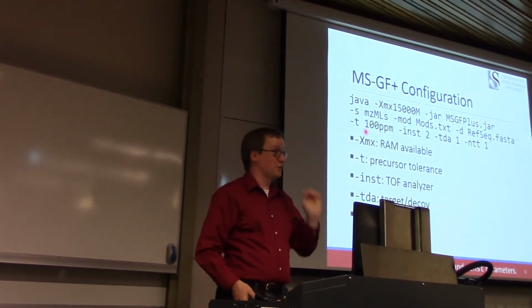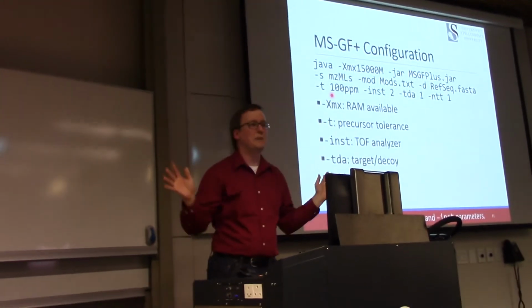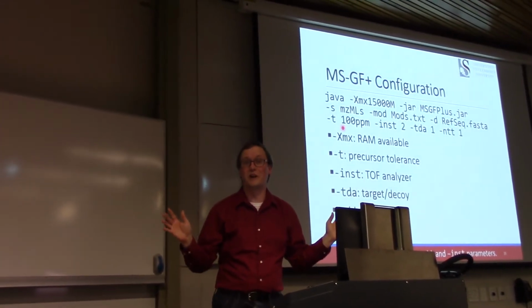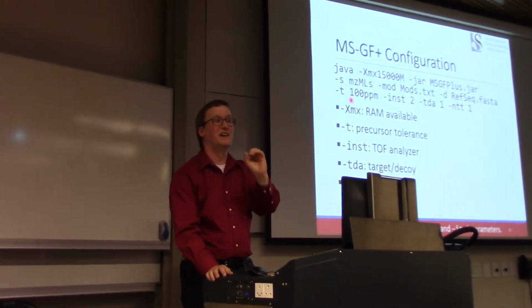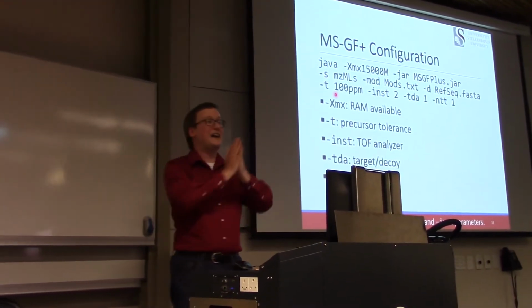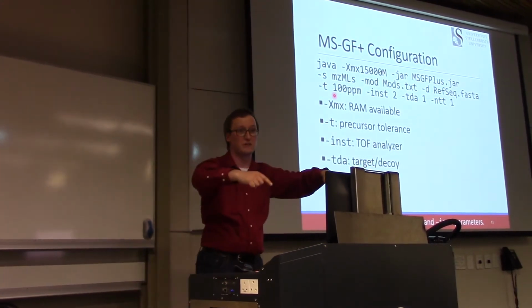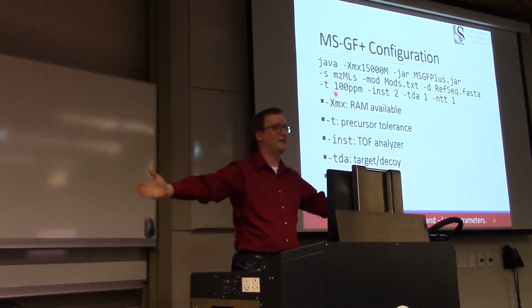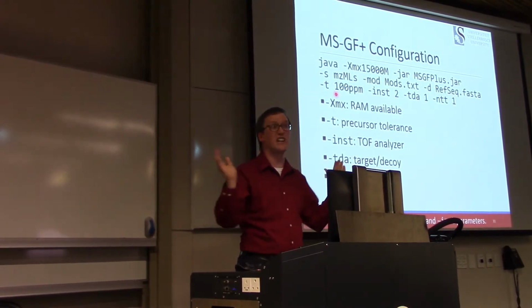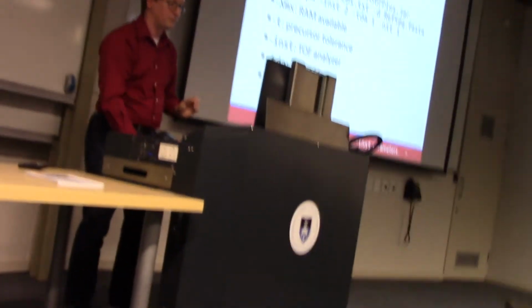And while it's true that the dominant peptides in this mixture have less than 10 ppm mass error on them, there are a great many identifiable spectra that have much greater mass errors than that. So if I allow for a wide precursor mass tolerance, I identify more spectra from these files than if I allow for a very narrow one. So I'm not going to be running any 10 ppm search on these. I will not get all the information yield out of them.